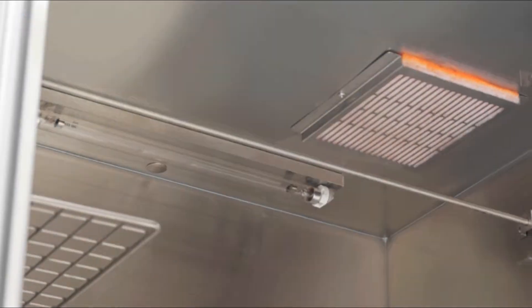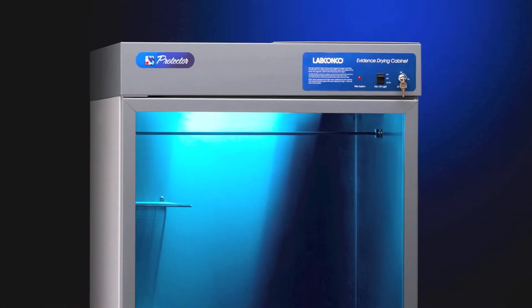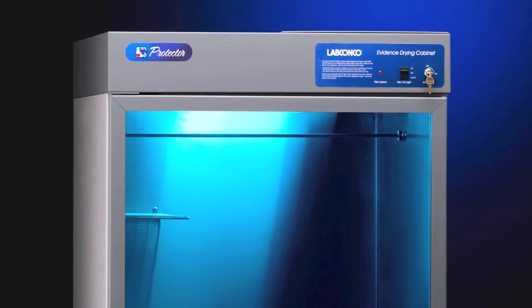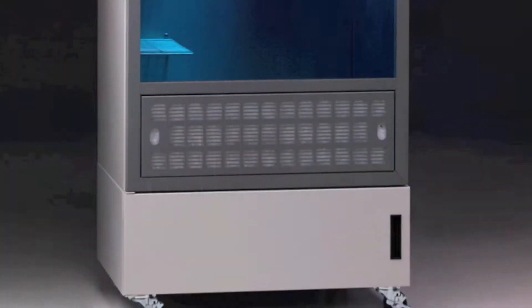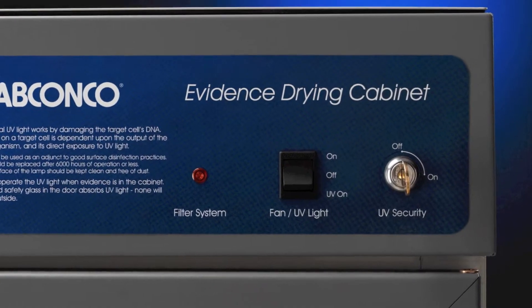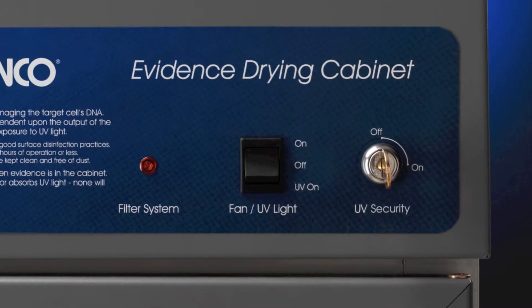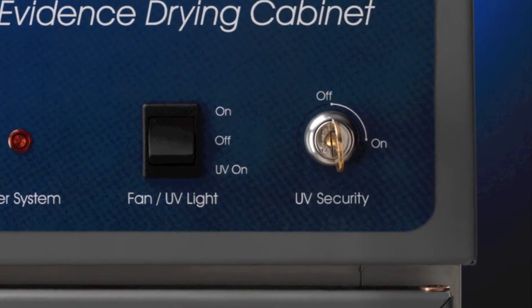The UV light model features a UV light that provides secondary decontamination of the cabinet interior after evidence is removed and the cabinet is disinfected. To ensure drying evidence is not radiated with the UV light, a UV security lock limits access to the ultraviolet light switch. A key activates the switch and may be stored in a remote location.